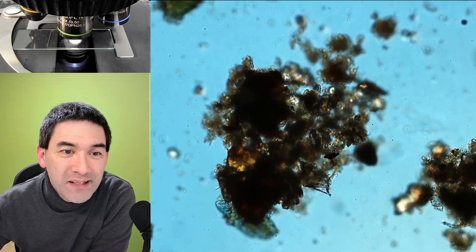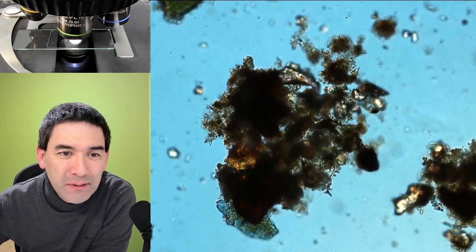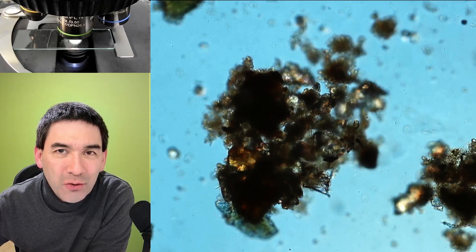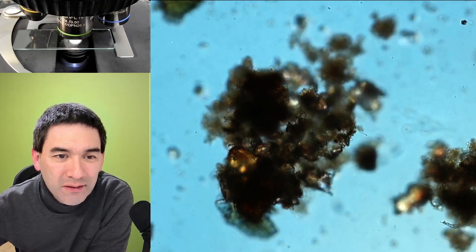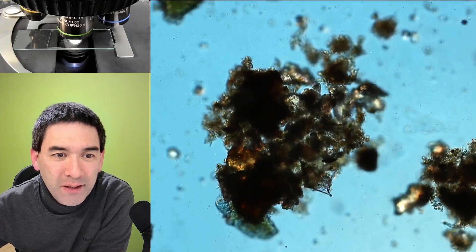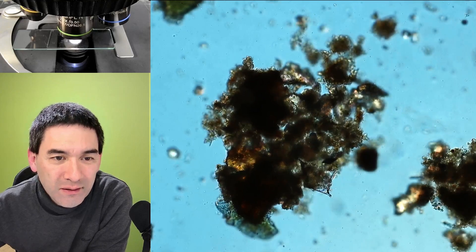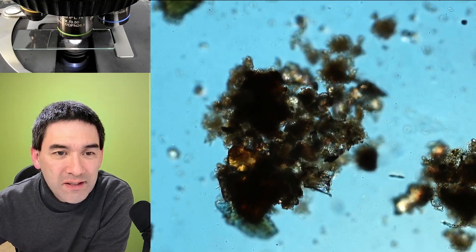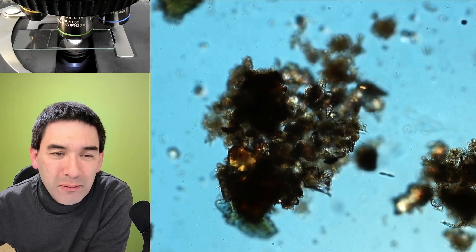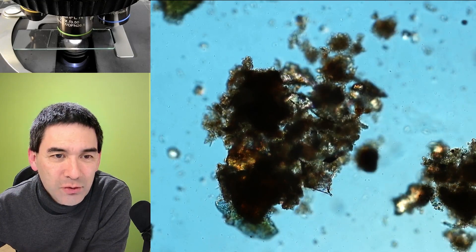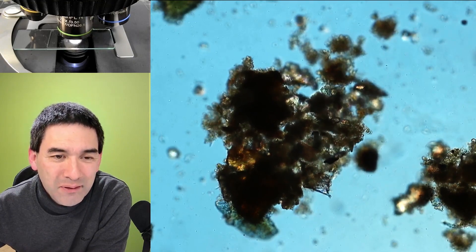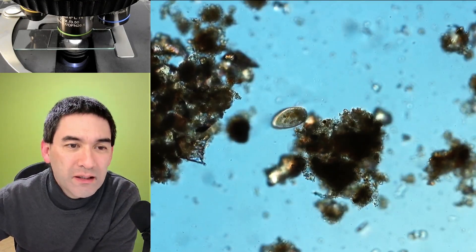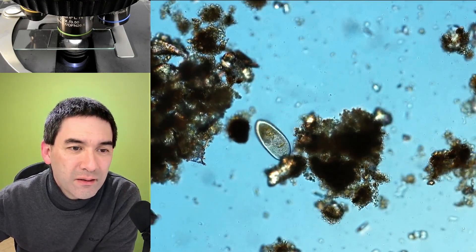Well there's also some movement going on here, this is a nematode worm, a little bit difficult to see but these tiny worms are also quite common. Here completely covered up now by the debris and the sand grains and whatever is in there but this is a worm. If you're lucky then we're able to see it, occasionally you're able to see a little tip of the worm.